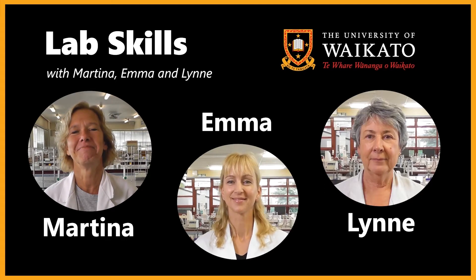Martina, Emma, Lynn. In this video you will learn how to set up, load and run an agarose gel.